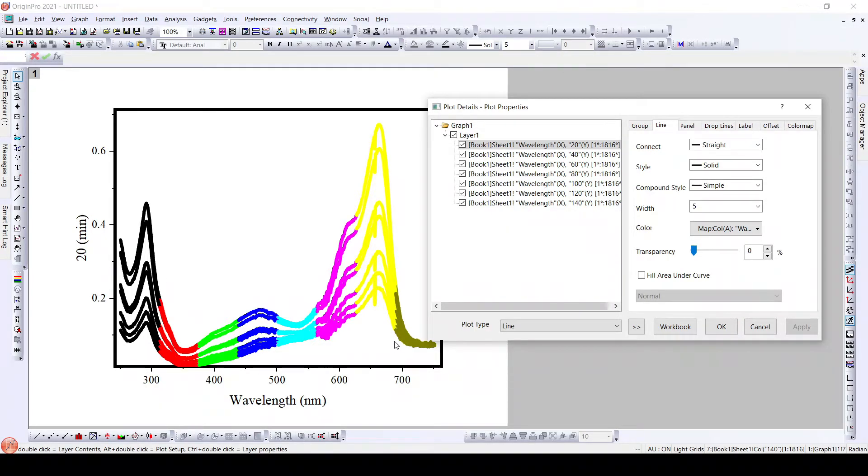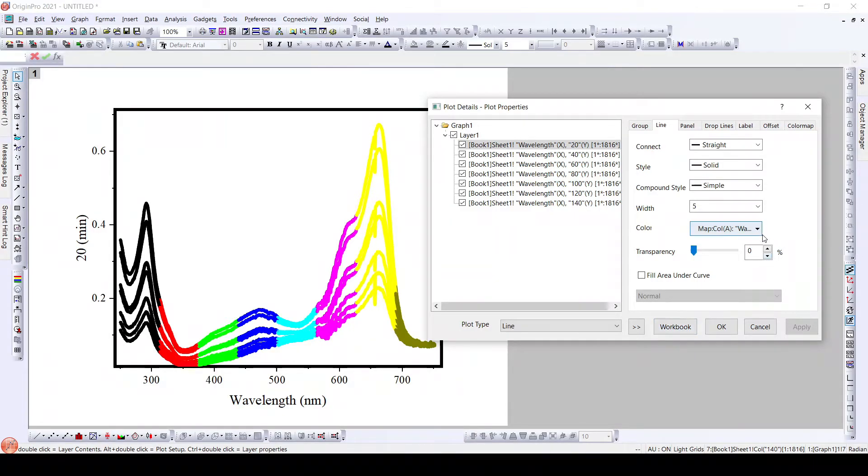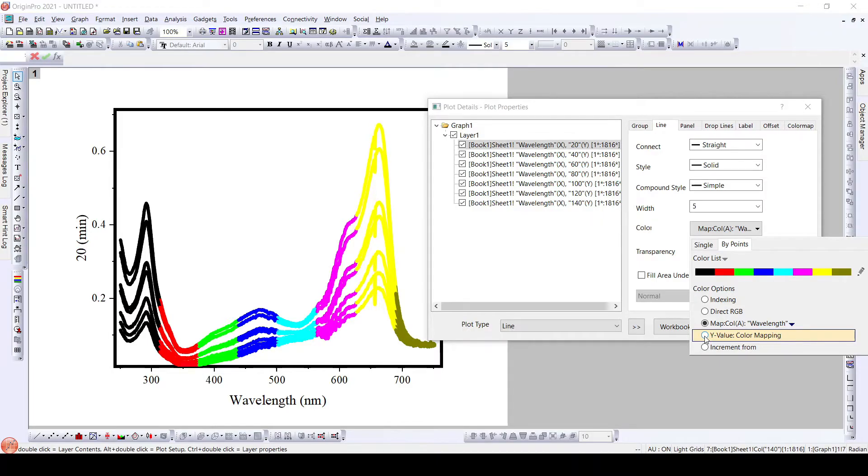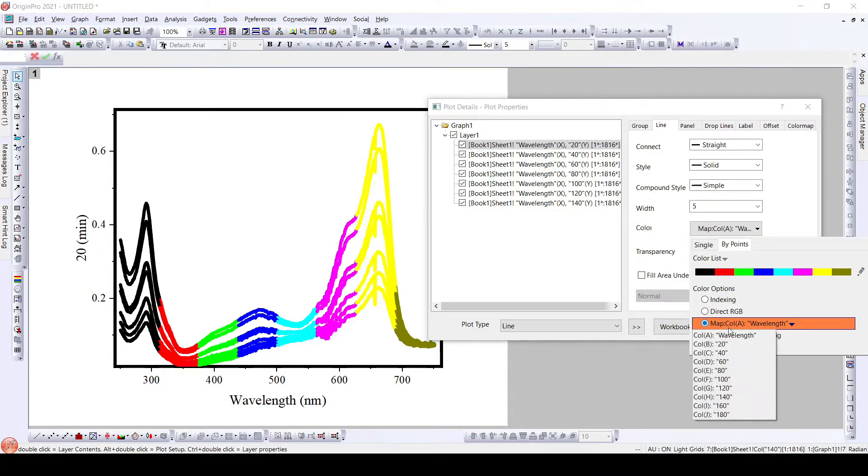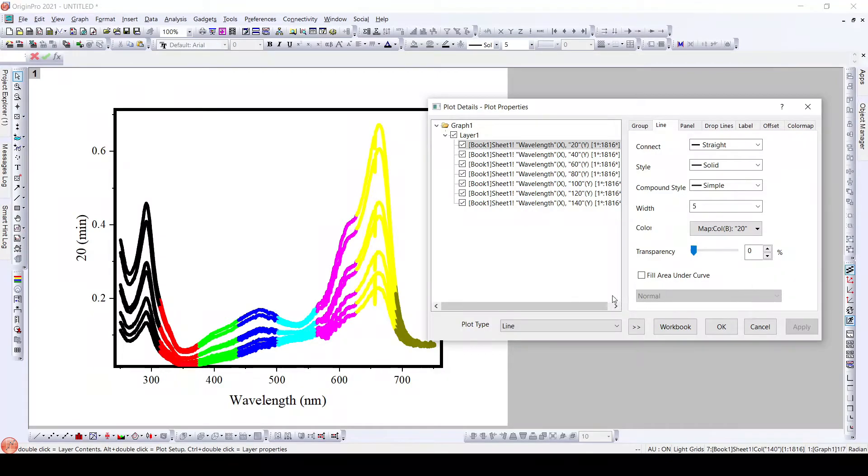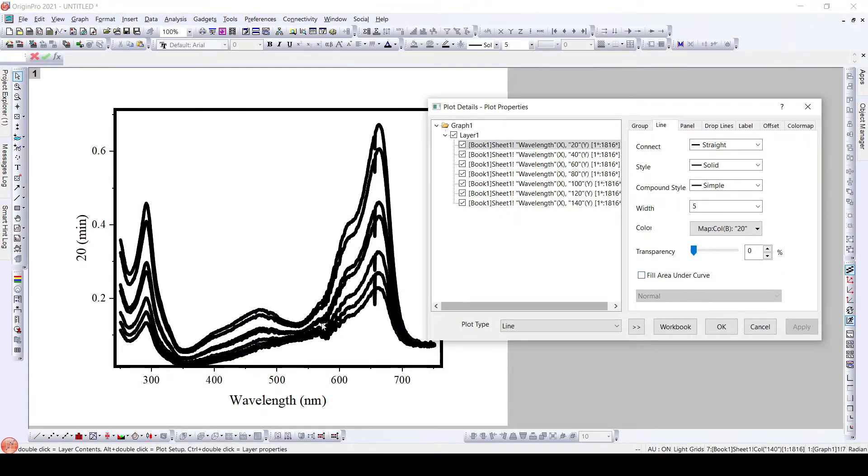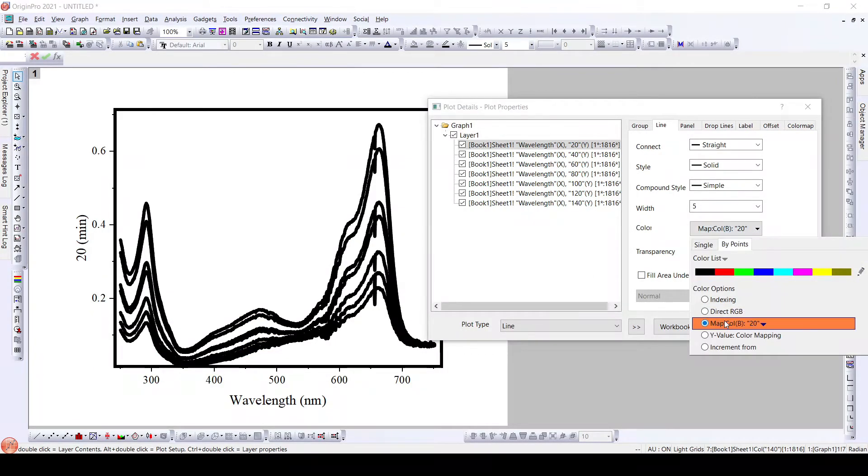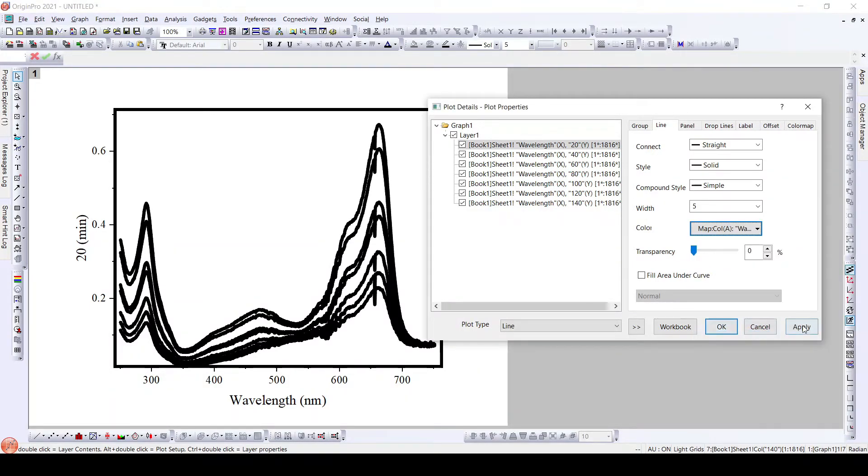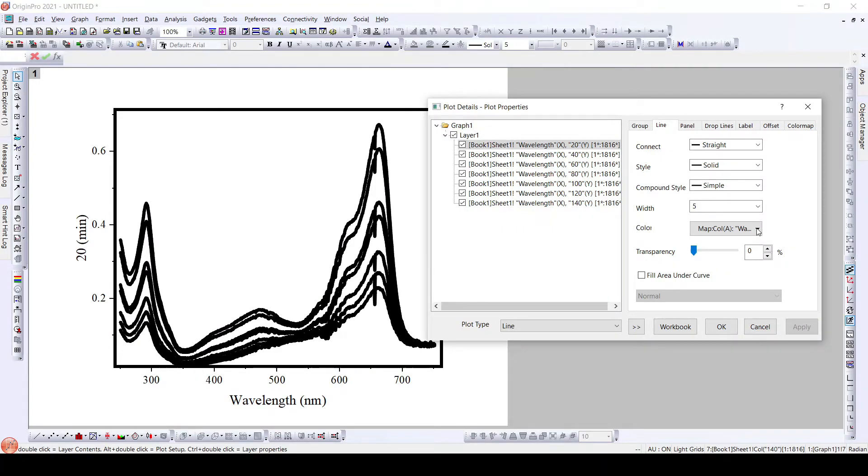Further, what we can do is we can change the value. Y-value color mapping. Here it is x-value color mapping. Here we can, here if we select the column b, what we see is all the graphs turn to be black. So it's only used for x-axis color mapping and we can have different colors using this color mapping.